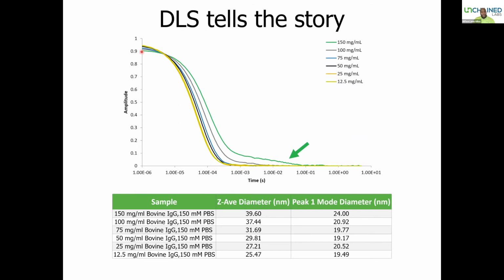Presumably, the longer it takes for a signal to decay, the larger you are. We can see that at a high concentration, it takes a bit more time before it begins to go down, whereas at lower concentrations, it goes down a little bit sooner. But what I'm showing you with the arrow there is that the baseline doesn't quite get flat here, and so you have this jagged noise that happens. Again, that's telling you that the structure is very dense, and you have a quasi-gel-like material existing in your sample.